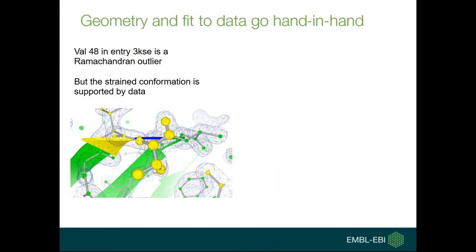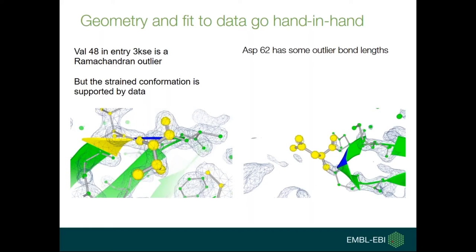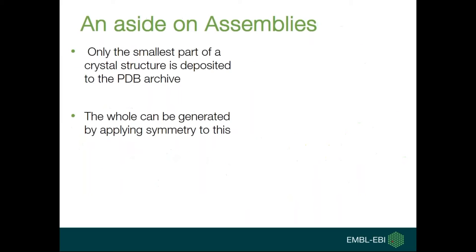It's important to note that geometry and fit to data go hand in hand — you can't assume a geometric outlier means a structure is wrong without looking at supporting data. In PDB entry 3KSE, valine 48 is a Ramachandran outlier, shown as yellow in the validation colouring, but the literature and electron density strongly support that strained conformation. On the other hand, aspartate 62 in the same entry has outlier bond lengths but very poor electron density — those aren't justified by the data and likely represent a slight error in model building.